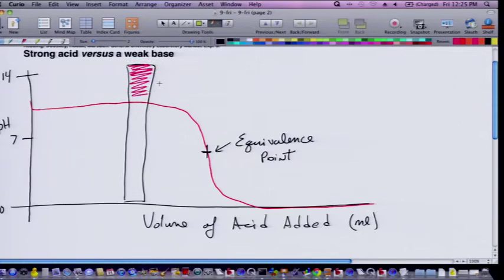Because phenolphthalein, the color change is going to be happening either prematurely before you start your titration, or maybe during this titration of the weak base, or it's already happened because the weak base has a lower pKa than phenolphthalein. So phenolphthalein is a poor choice. You couldn't work with it. And because I've limited the cases here, you say, well, of course you know the answer. The answer would be to use methyl orange.